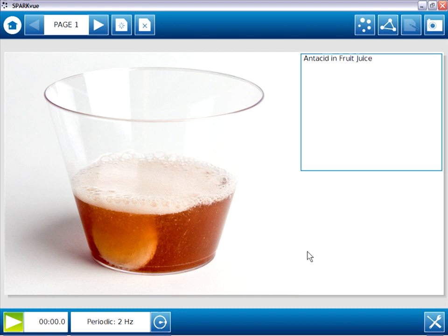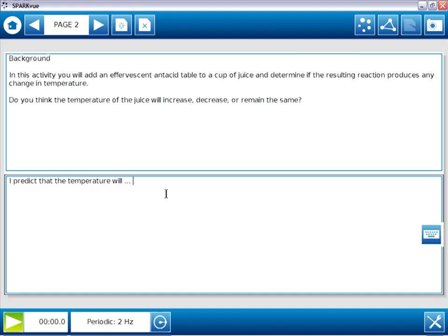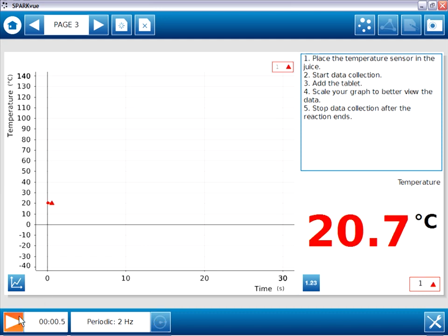Now, before I actually distribute this, I probably should go through and test its functionality. So I'm going to walk through it as a student might, interacting with anything that's interactive. So I'll have a response here, make sure everything works. And on page three, I'll actually collect some data following these instructions. So I'll begin by placing the temperature sensor in the juice, starting data collection. And we can see the data appears on both the graph and the digits displays.